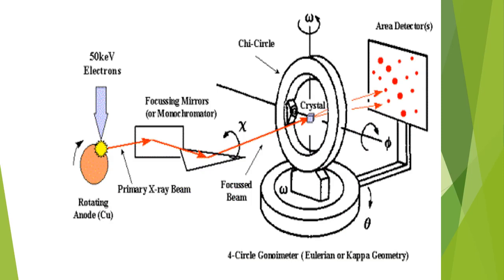Each kind of crystal of different elements or molecules has a different diffraction pattern, which can be studied by using different software attached to the X-ray machines on high-end computers.